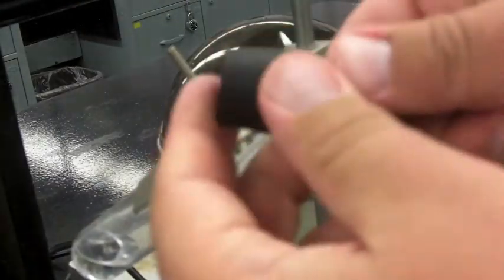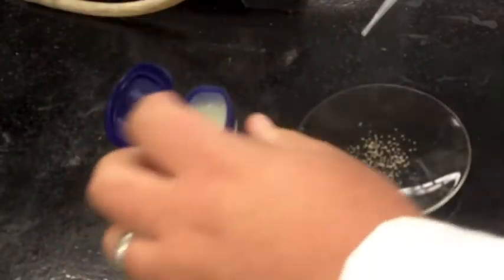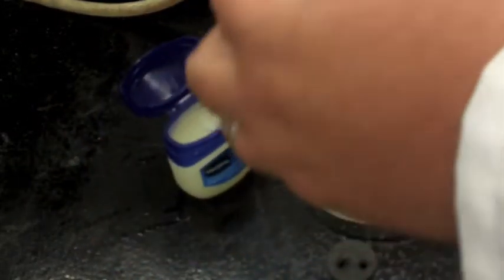We can clamp and put the stopper in. Now, what we're going to do is pull the little stopper part off and just leave that out, so then we can get our stick ready. For the stick, we're going to put a little Vaseline on the whole thing. These are just wooden sticks. So you need to lube the bottom two thirds of it with Vaseline.